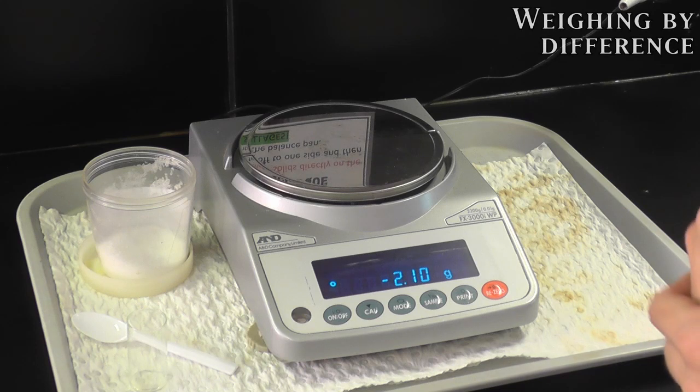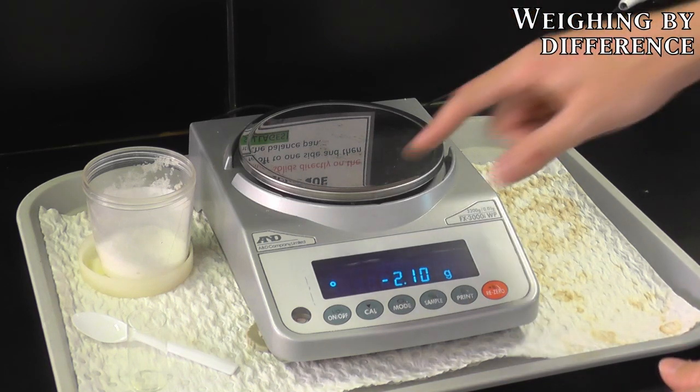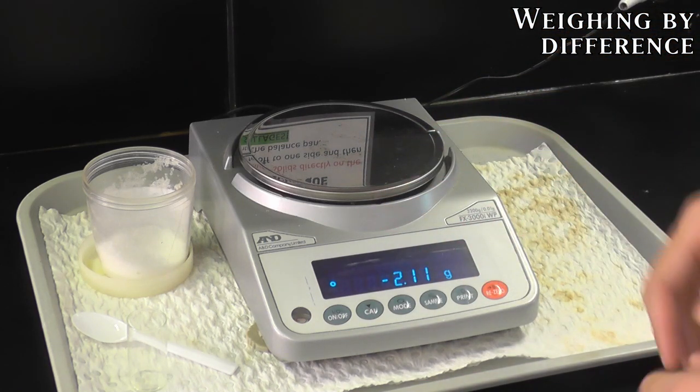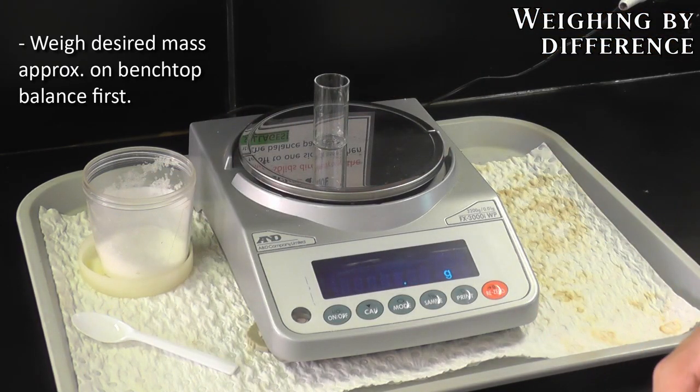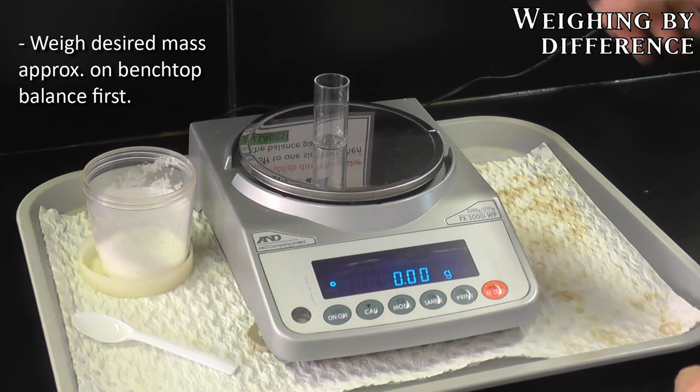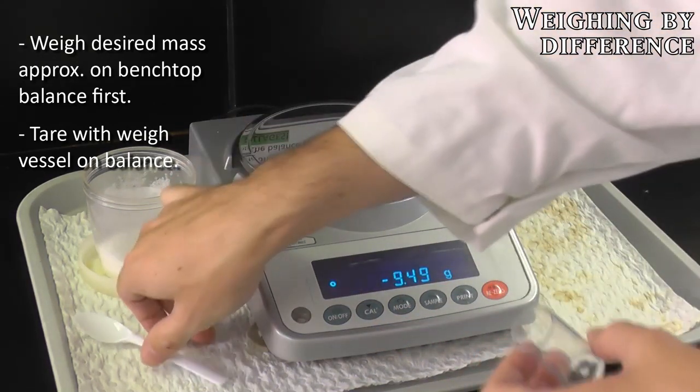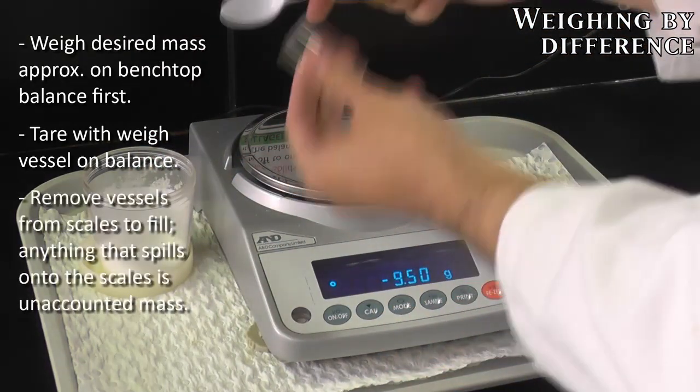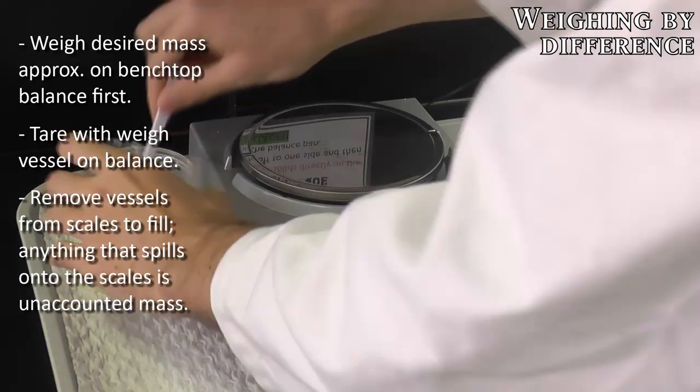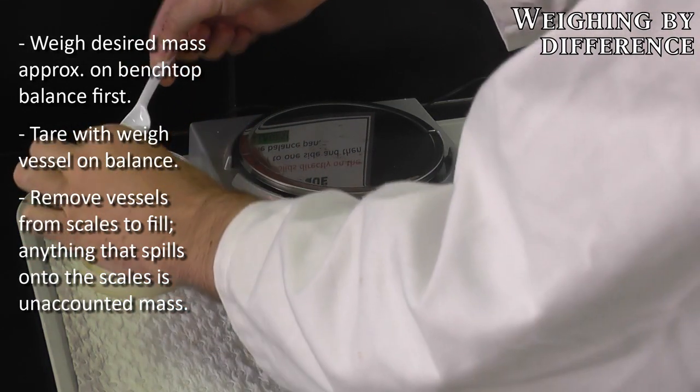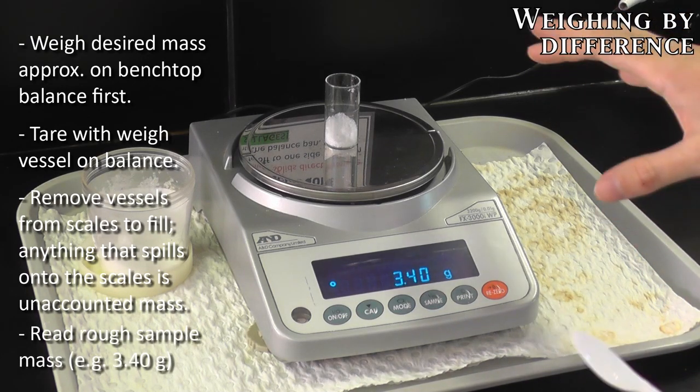An important skill in first-year labs is weighing by difference. The first step is to come and get a rough measurement on something like this bench top balance. You may notice that the reading is not zeroed initially. So what we want to do is grab our container, I'm using a soda glass vial, stick it on the top and hit re-zero, or tare, depending on your scale. That tells the scale that there's essentially nothing on the balance, and anything we add into our vessel is going to be the mass that it measures. It's very important to take these vessels off of the scale, because if you spill anything directly onto it, that is mass that's not accounted for within your container. So I've got about 3.4 grams here, roughly.